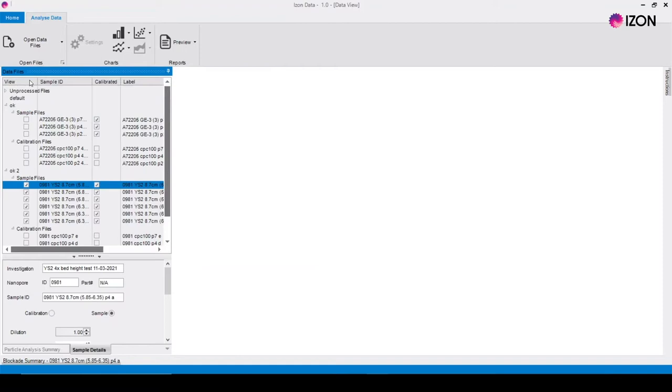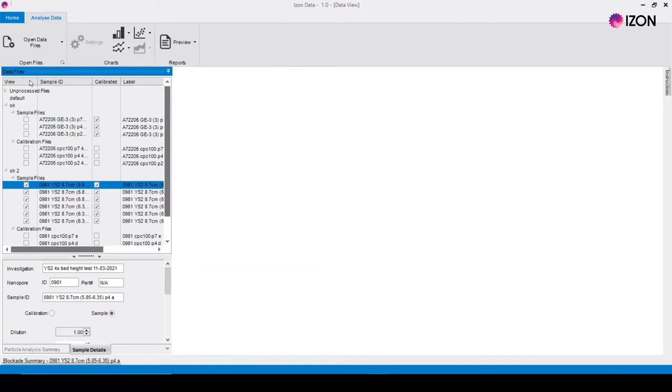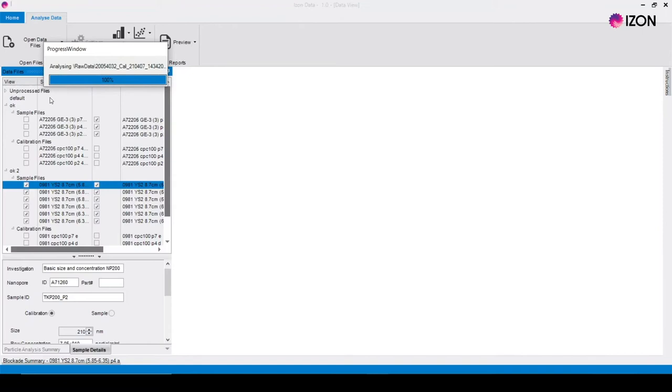In the software right click on unprocessed files and select process files. This can take several minutes for large data sets.